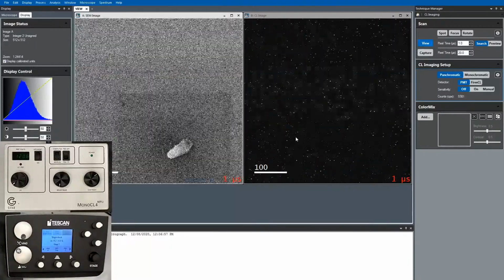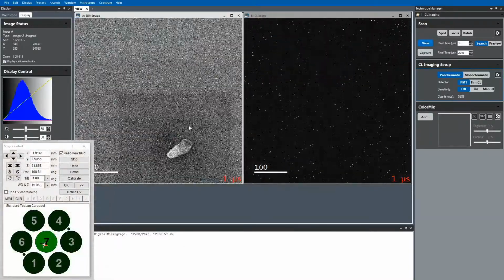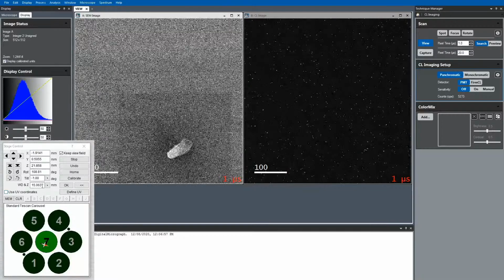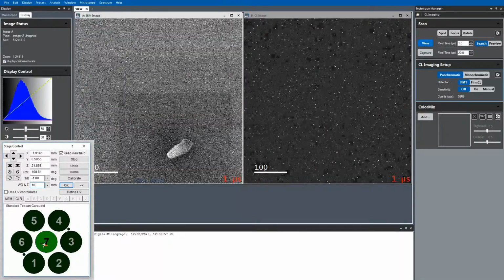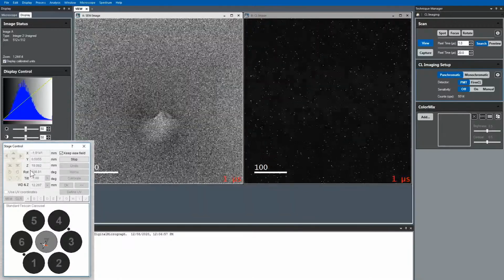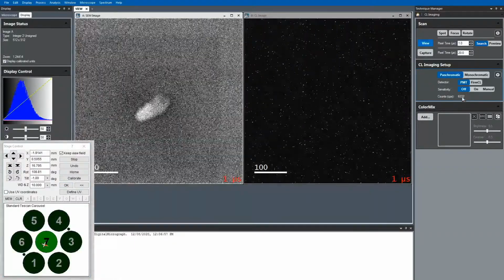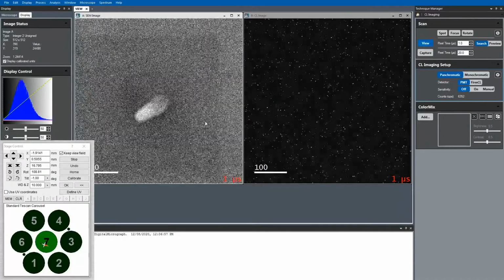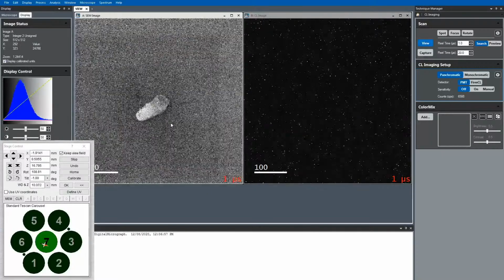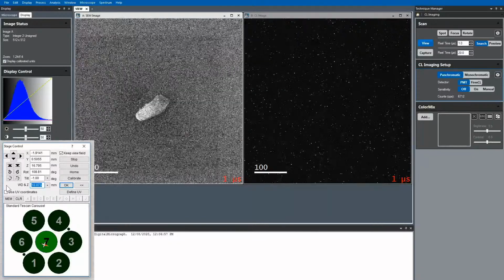I want to start the march up to 6.5 millimeters. So I don't want to go straight there because it's not very safe. So what I'm going to do, I've now got overlaid here the stage information from the Mira software. I'm going to start at 10. 10 should be nice and safe. One thing you notice, we went from an average 5,000 counts up to 6,300 counts. And I'm going to refocus. Doesn't need to be perfect.